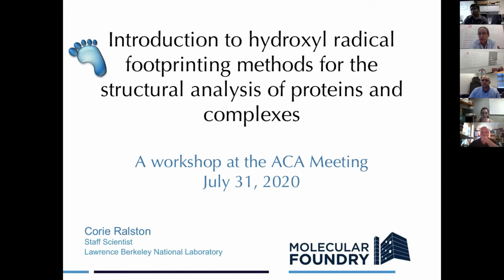I'm going to give a brief overview before we start. Footprinting is a structural biology method that gives you really valuable information about protein structure, protein dynamics, protein-ligand interaction, and protein-protein interactions. It's really not as well known as crystallography, small angle scattering, NMR, or cryo-EM. As I was preparing for this workshop, I started to wonder, how not well known is it really?